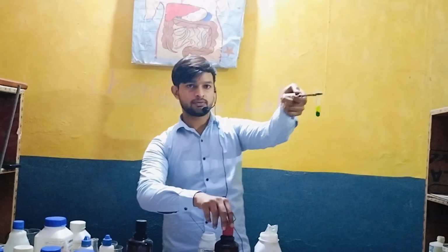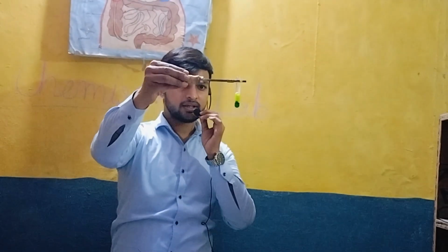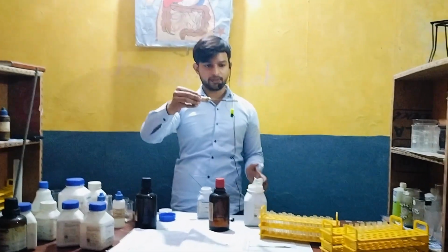Please zoom it out. Everyone see. Now observe it carefully. You can see the reaction starts. So what is happening inside the test tube? The zinc is reacting with the copper sulfate. Zinc is replacing the sulfate ion of copper, and it will settle down with its sulfate and form zinc sulfate, and the copper will be separated out.